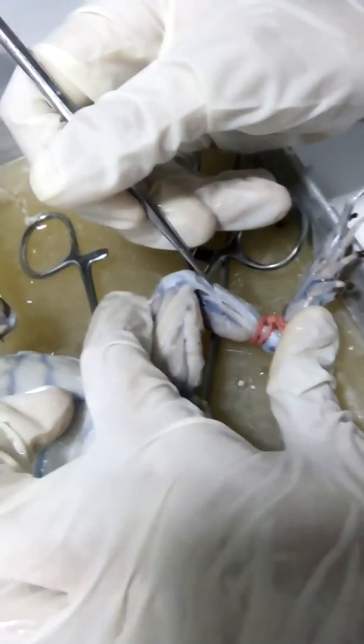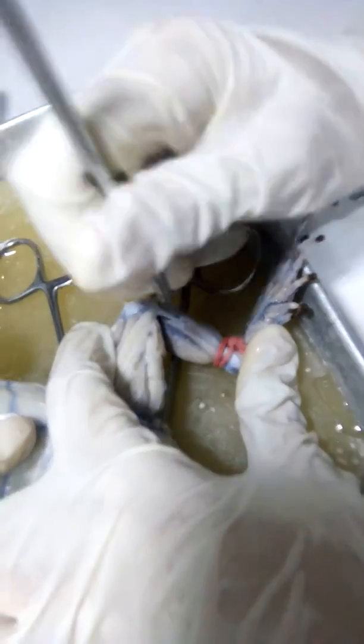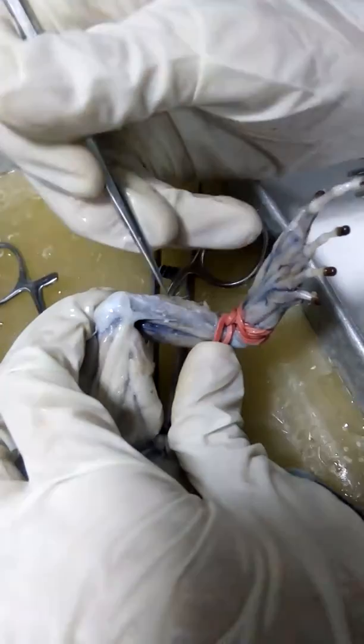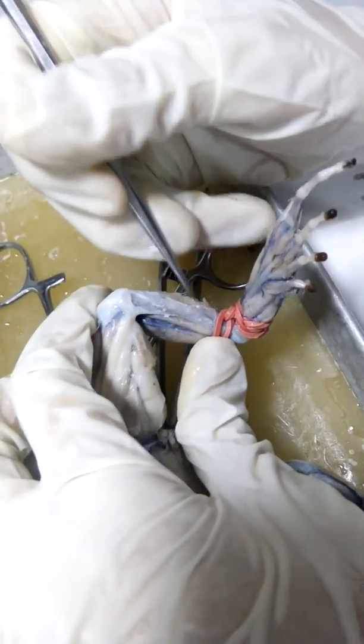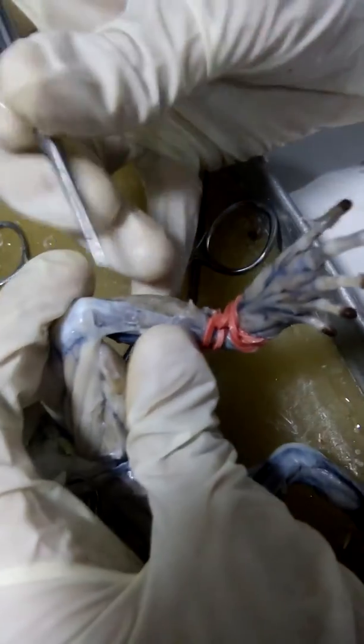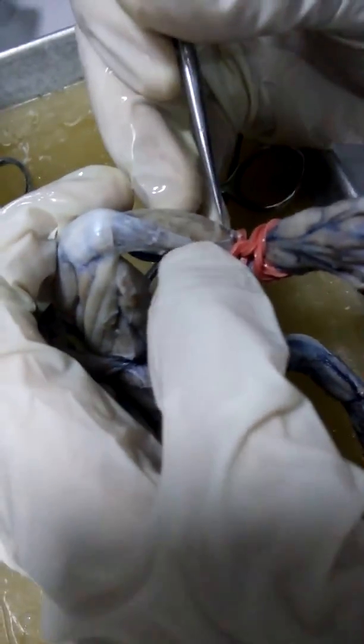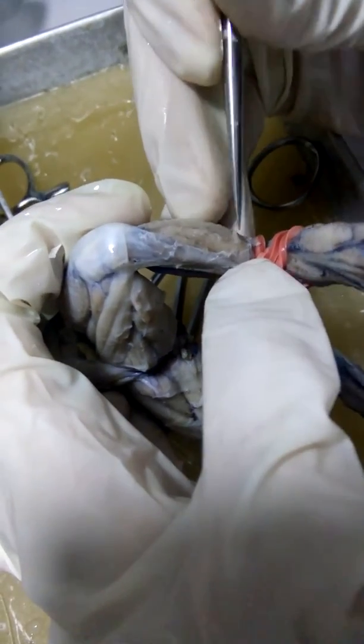And then bukog na siya. So lateral to it is your extensor cruris. And then if we continue, we can see now your tibialis anticus longus containing 2 heads. So kani, 2 heads na siya.